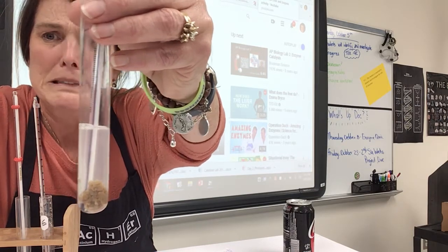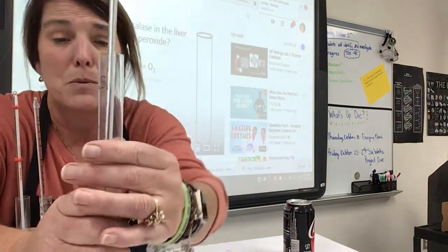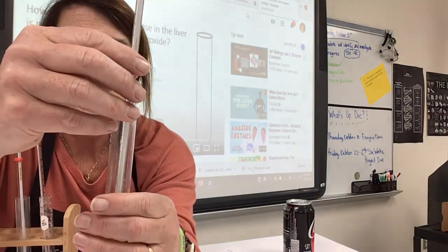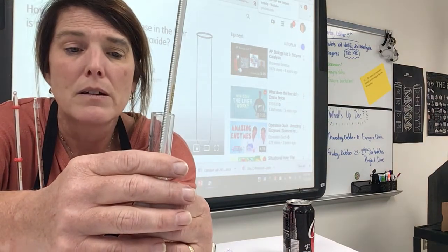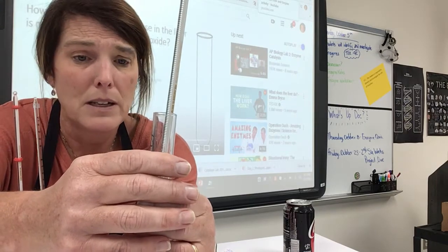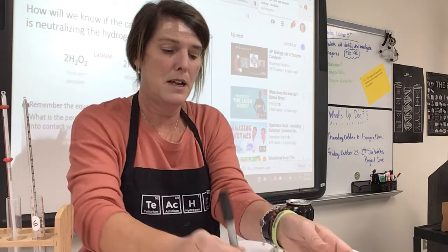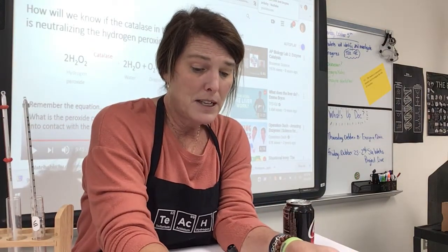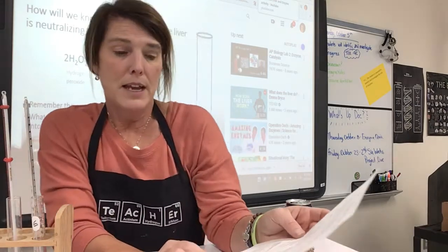Oh, bubbles, where'd you go? I don't even feel warmth. Looking at my temperature, it hasn't moved. We're still sitting at 20. 20 it is. Okay, so my acid and my enzymes at 0 degrees temperature change. You guys decide the bubbles.